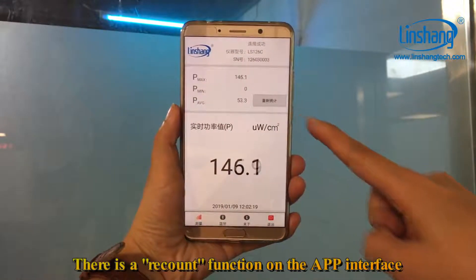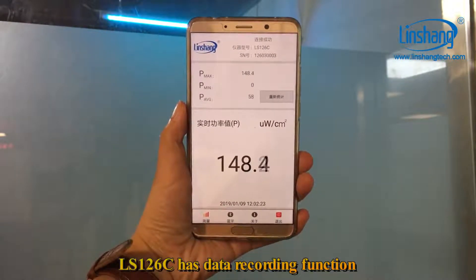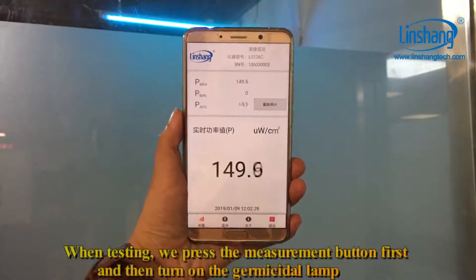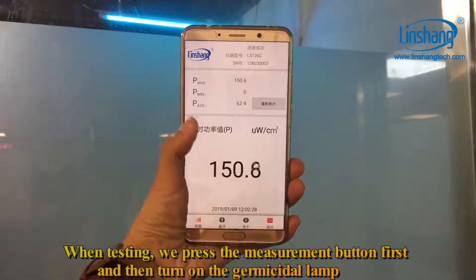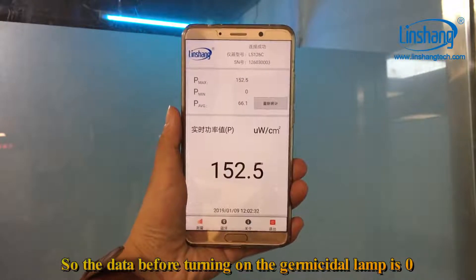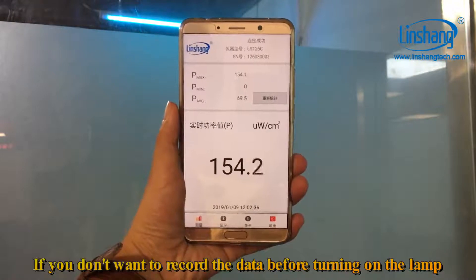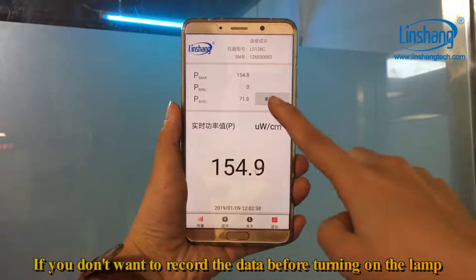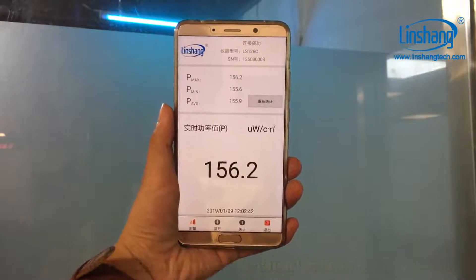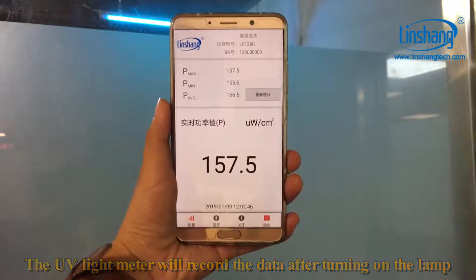There is a recount function on the app interface. The LS126C has a data recording function. When testing, we press the measurement button first and then turn on the germicidal lamp, so the data before turning on the lamp is zero. If you don't want to record the data before turning on the lamp, you can press the recount button. The UV light meter will then record the data only after turning on the lamp.